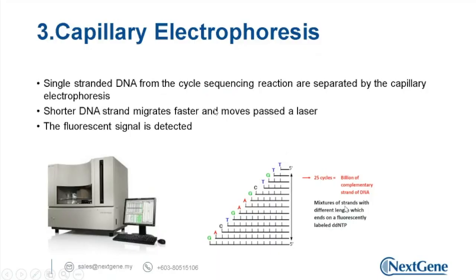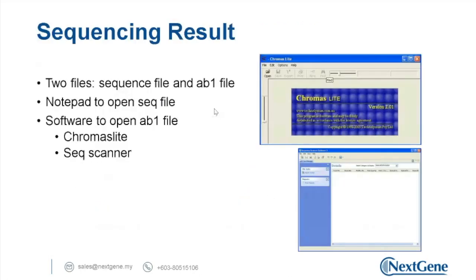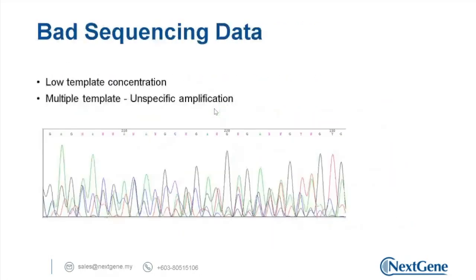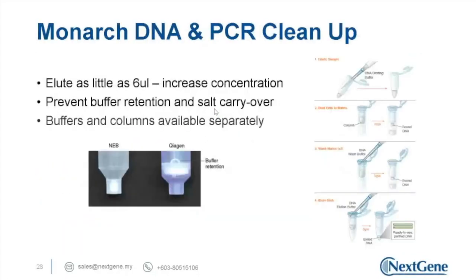So unfortunately, to me also, gel extraction will more often cause problems compared to PCR cleanup. One of the reasons is because the recovery of DNA fragment from gel is lower than normal PCR cleanup.